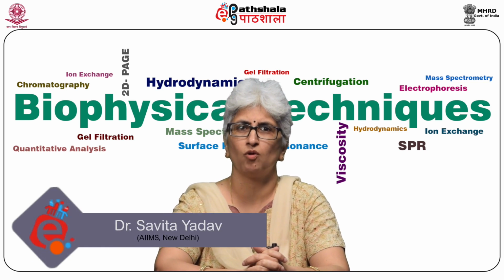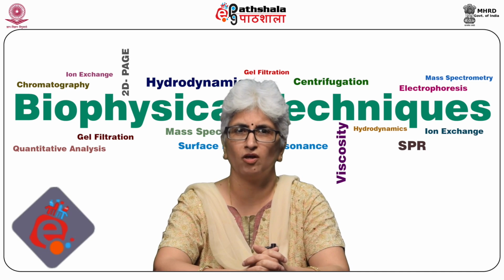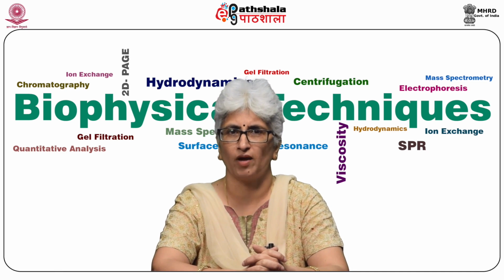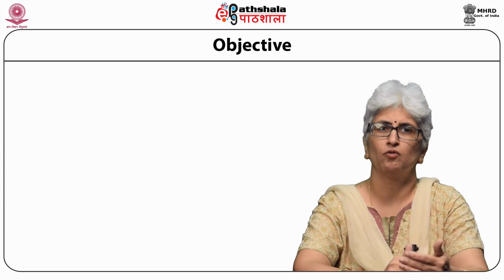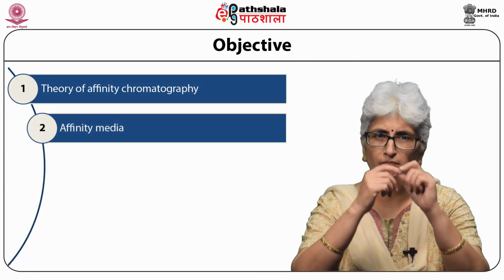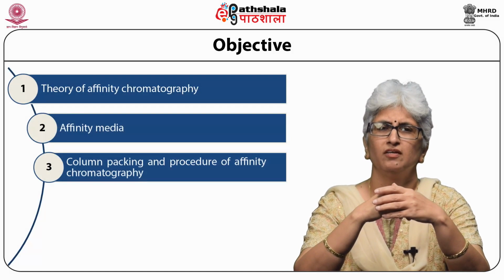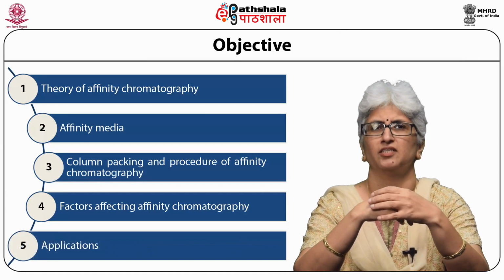Today we are going to talk on the module Affinity Chromatography: Principle, Methodology and Application, from the paper Techniques in Molecular Biophysics 1. So what are the objectives of this module? What we are going to learn from this module is the theory of affinity chromatography, affinity media, column packing, the procedure of affinity chromatography, the factors which affect affinity chromatography, and its application.